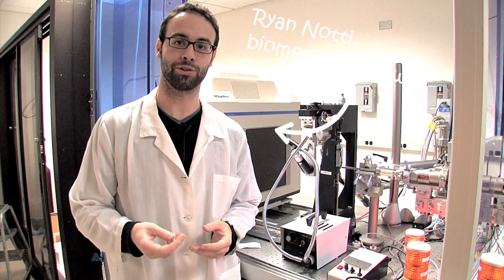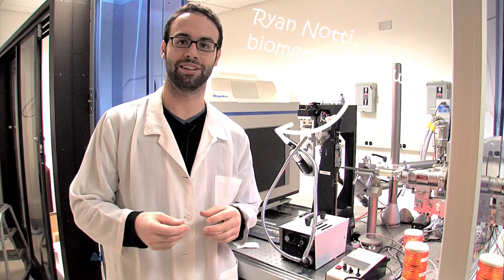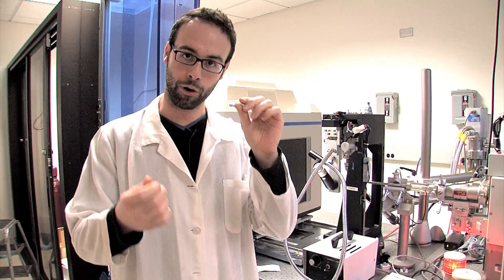So once we have our beautiful protein crystals, we need to find a way to get all that molecular information out of them. And the way we do that is by shooting X-rays at them. So just like when you break a bone and have to go to the doctor and they use X-rays to see the bones in your body, we use X-rays to look at our crystals. But instead of spread out really wide, say looking at my arm, we focus them into an ultra-narrow pinpoint beam and point them at our microscopic crystals.